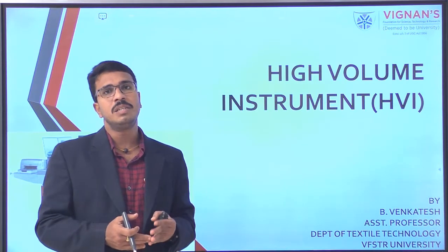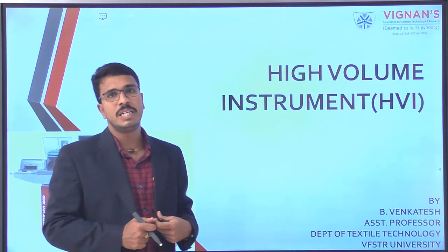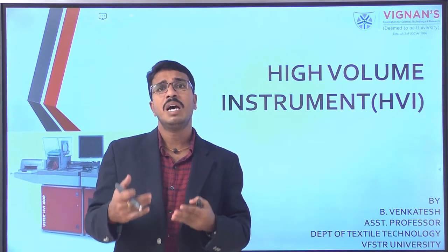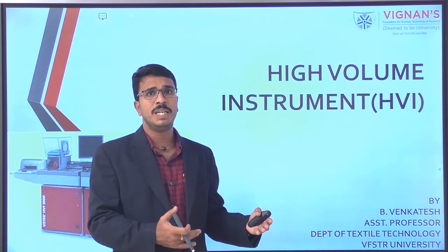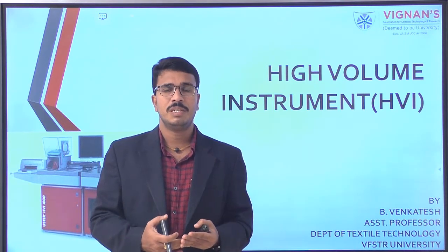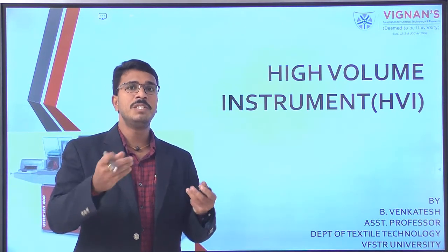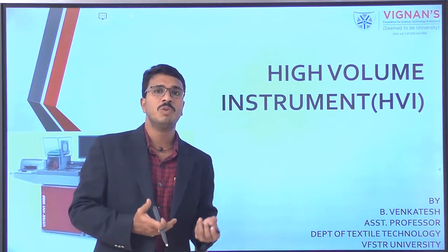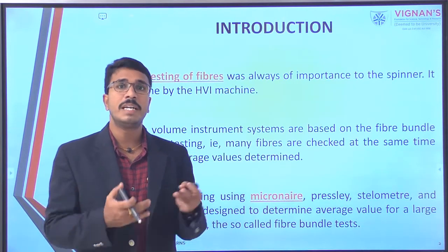Today we are going to discuss this high volume instrument. Generally in testing we have low volume, medium volume and high volume instruments, depending on the size of the spinning industry. From the name itself you can understand that the volume of fibers to be measured is more. So a bundle of fibers has to be measured at a time.